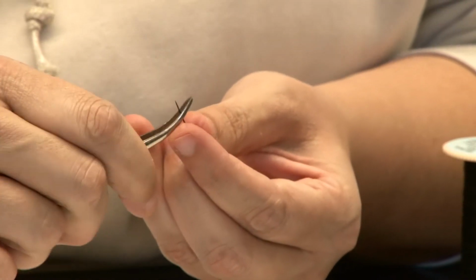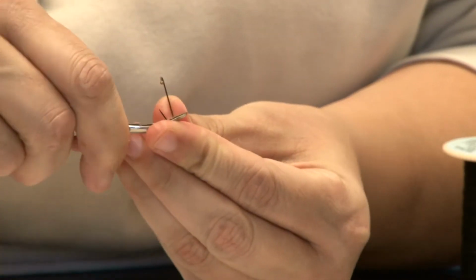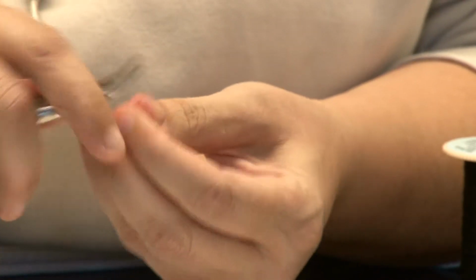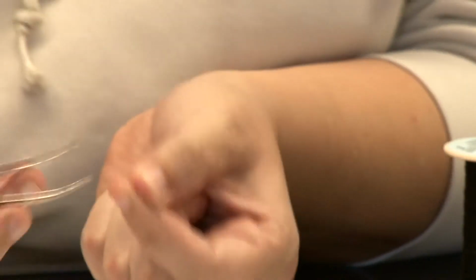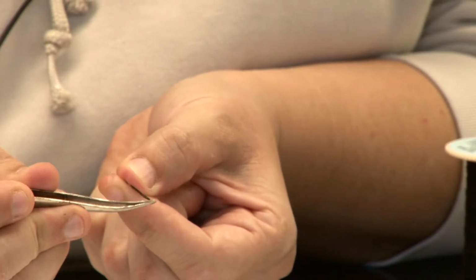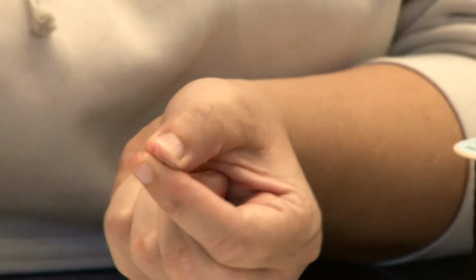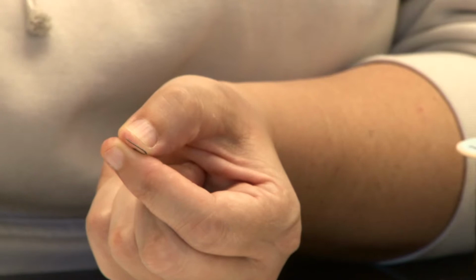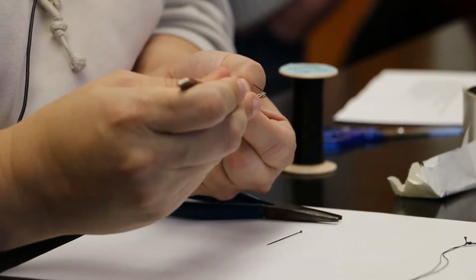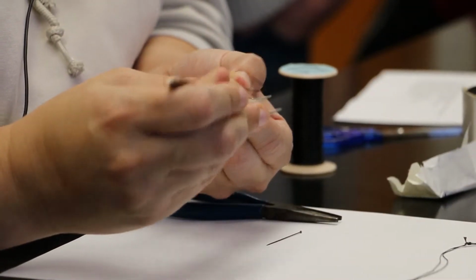Once you get it started, then you can grab that bent part and continue to bend it to where you get kind of a fishhook shape. All right, and notice that it has a point here down on the bottom, and that's what we want. We don't want it to be a pure fish hook, because then the ventricle will actually slide along. If we have a little point there, then the ventricle tends to stay in that point.